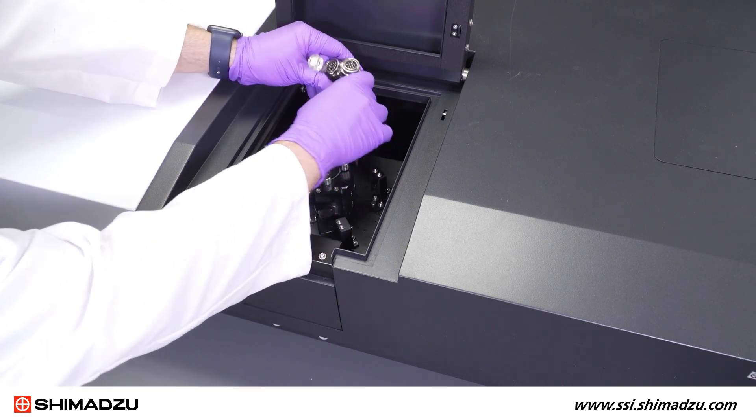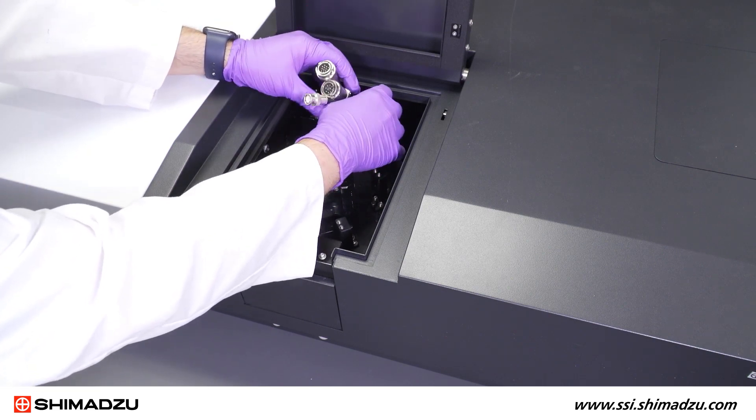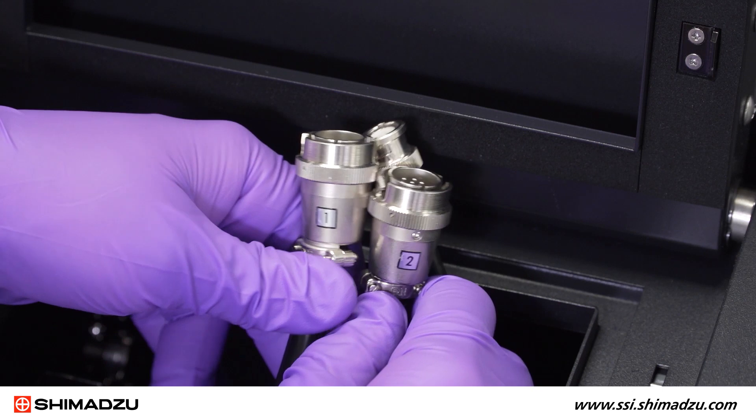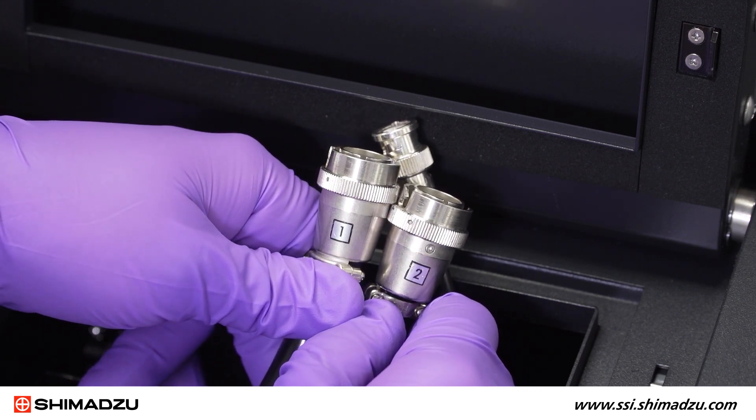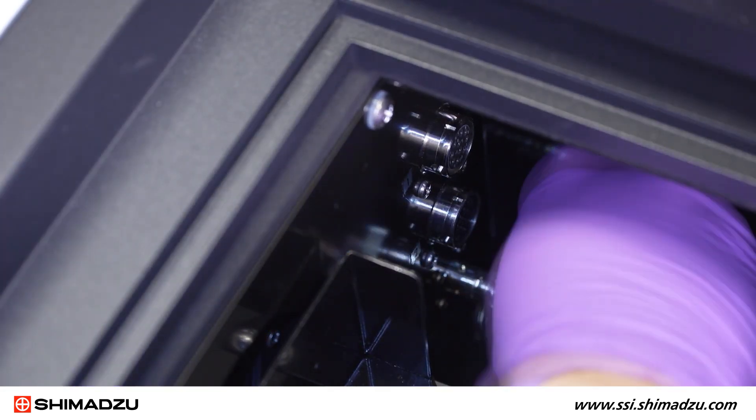Once the integrating sphere is installed, you will need to attach the cable connectors for the detectors. There are three cables that will be installed inside the sample compartment. Each cable is labeled with one, two, or three. Make sure to install the proper cable in each slot.